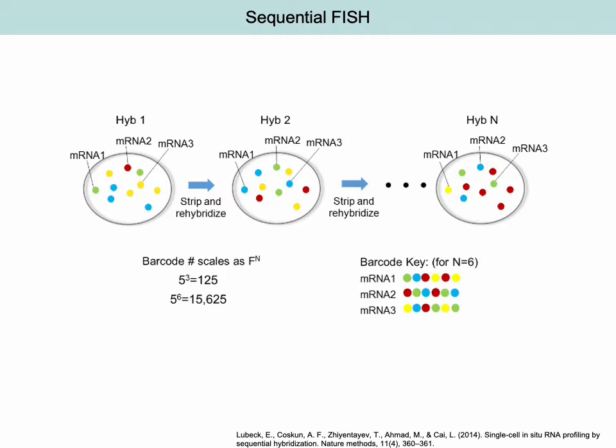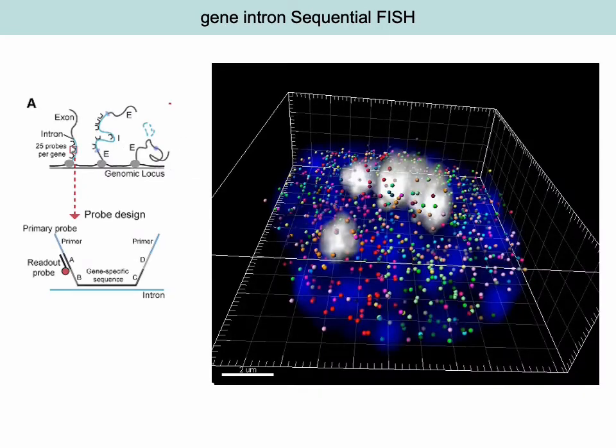After the first method paper, a Nature Methods paper published back in 2014, they showed that seqFISH could work well at the transcription level. In the left side figure, I also want to give a little background knowledge about the introns and how they applied it here.